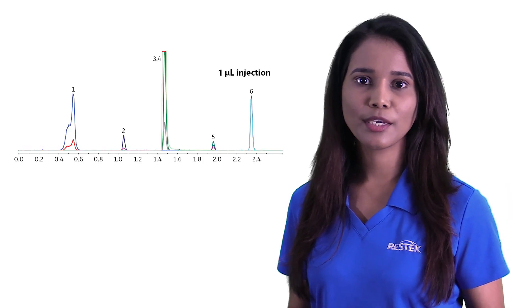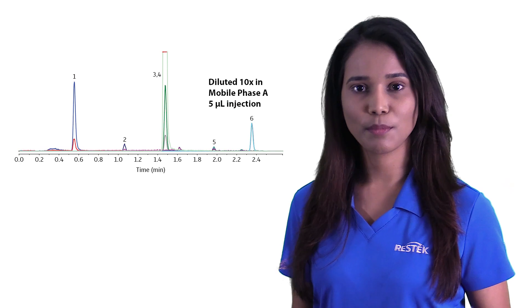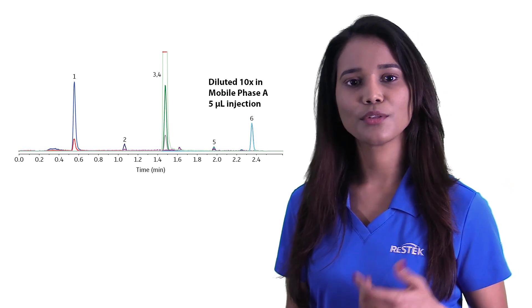You should always strive to match the aqueous to organic ratio as well as the buffer strength of the sample diluent to the start of the gradient. If you do not, it can affect elute retention time and peak shape.